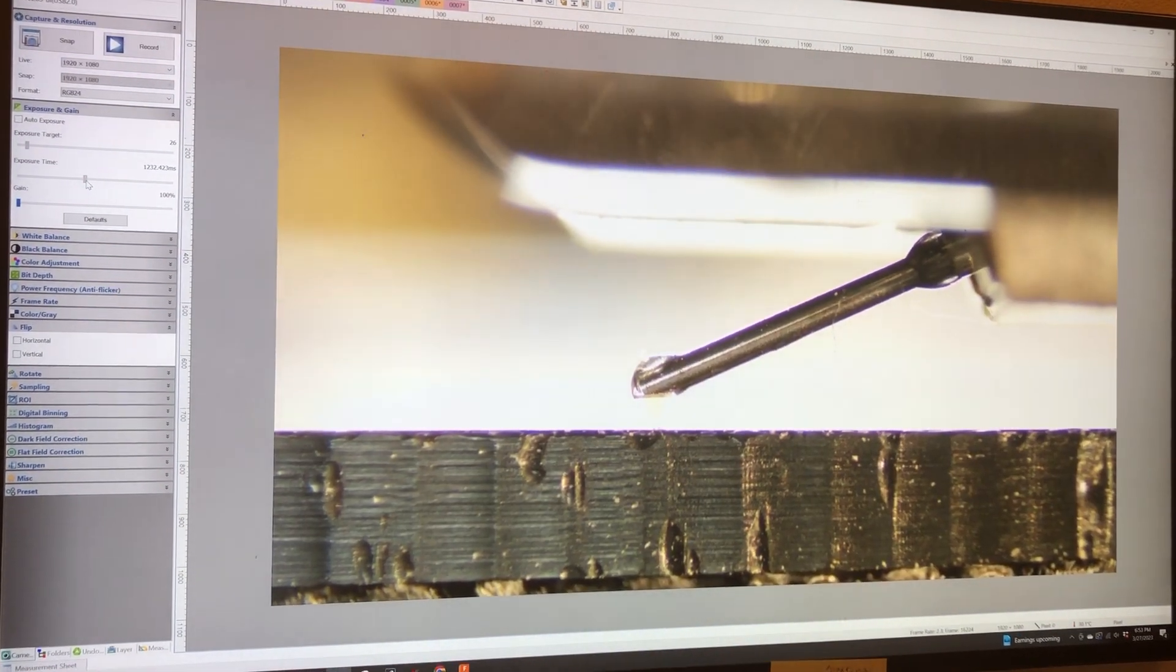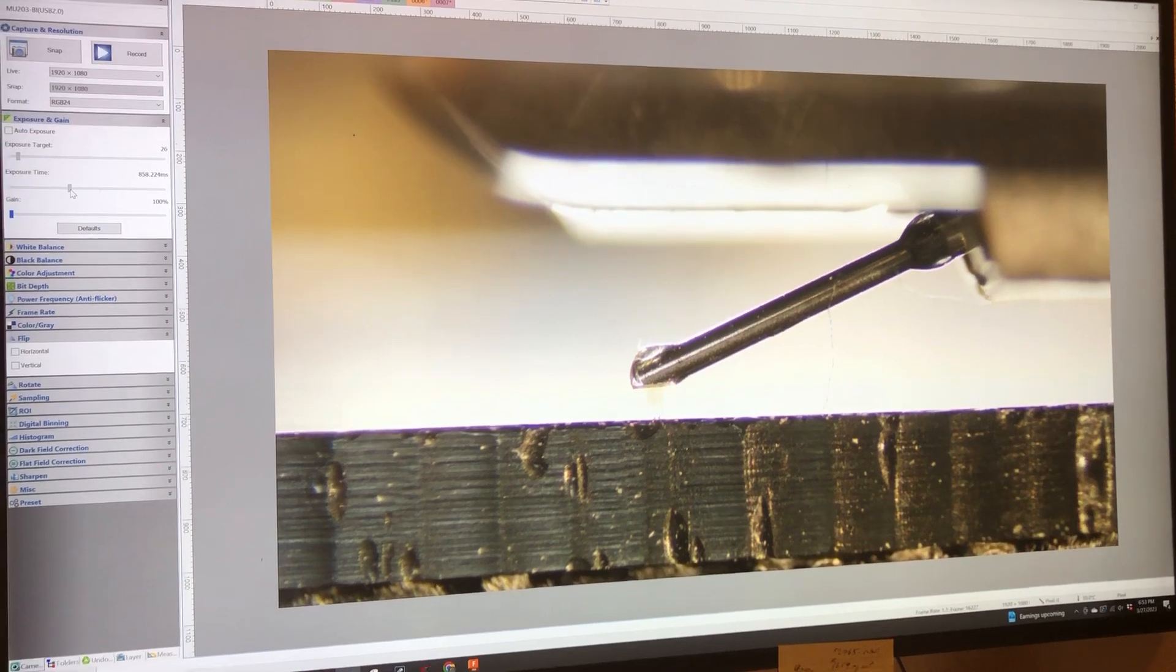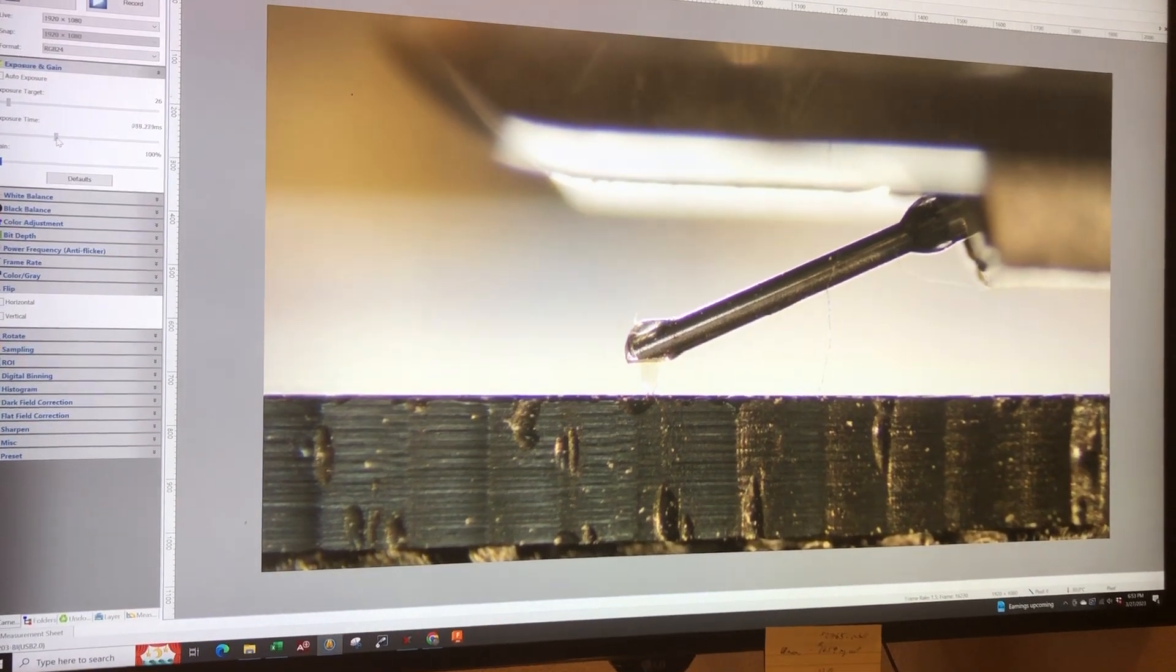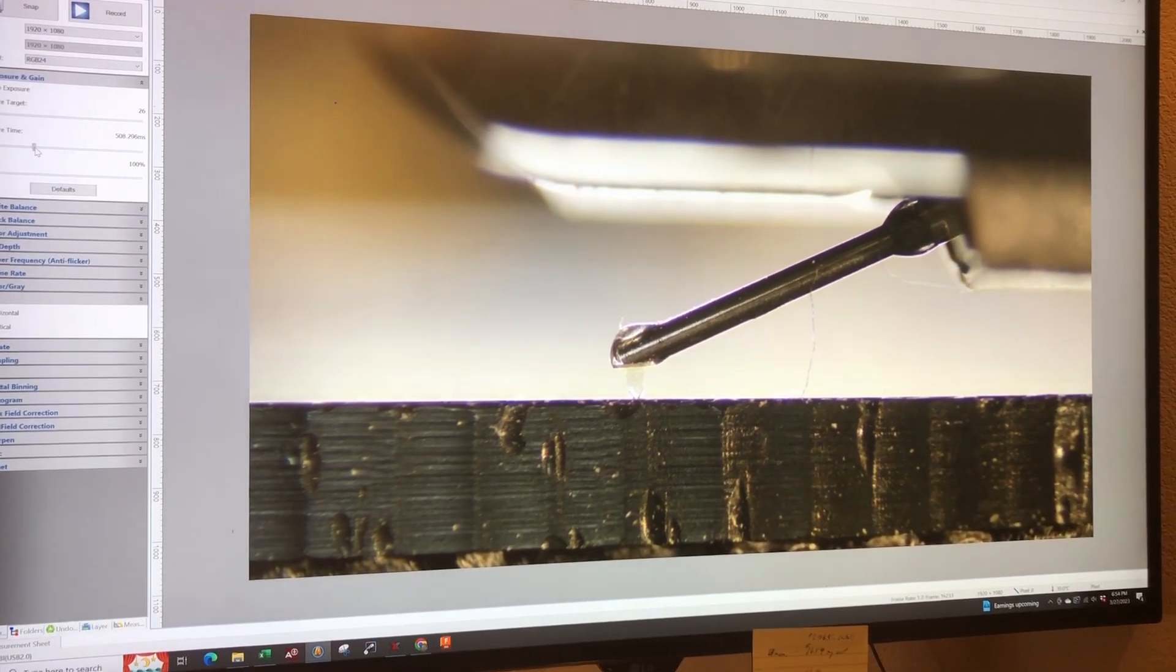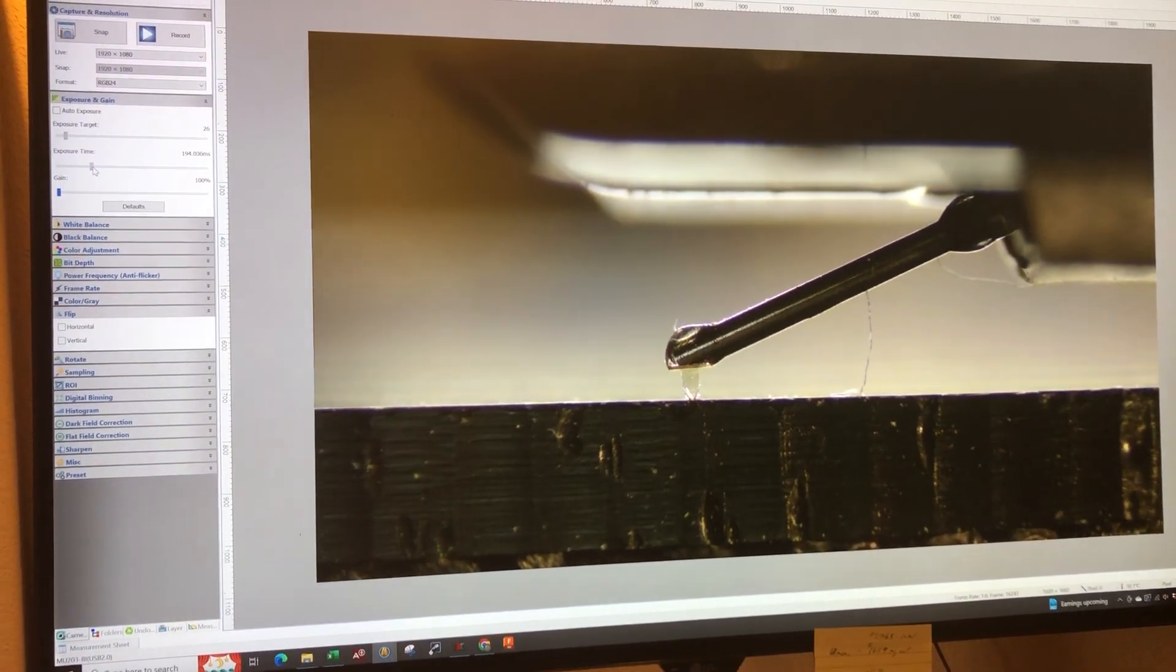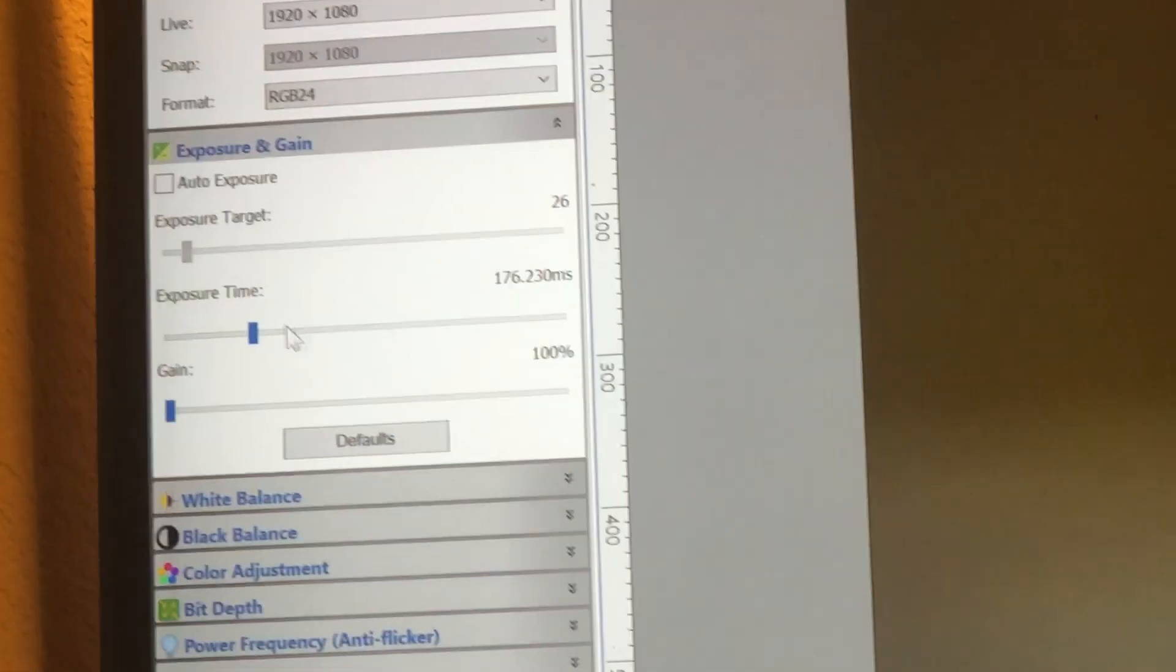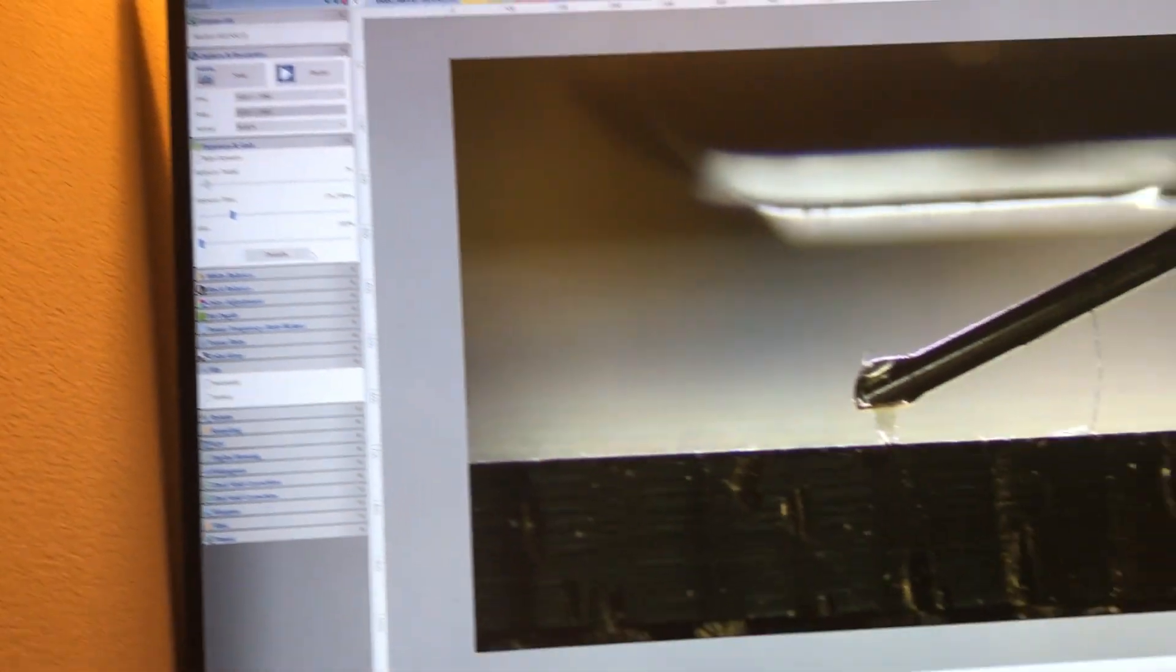It's because obviously the frame rate, or rather the amount of time the frame is staying open to accept light is increasing. I generally keep it in the 100 range which is pretty good for the lighting that I got around my desk.